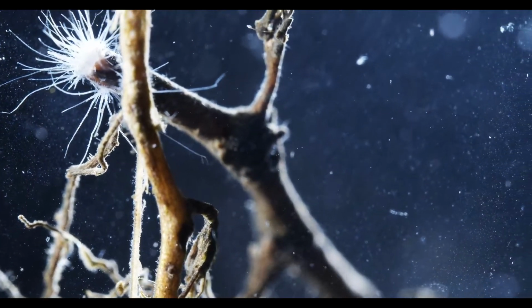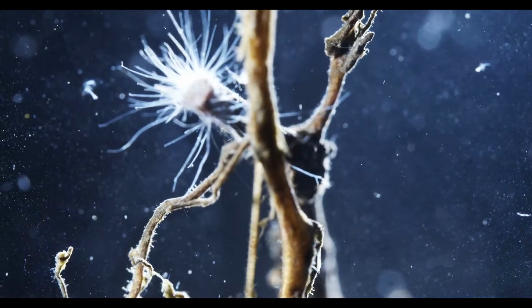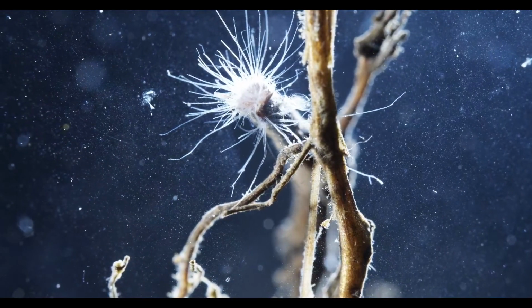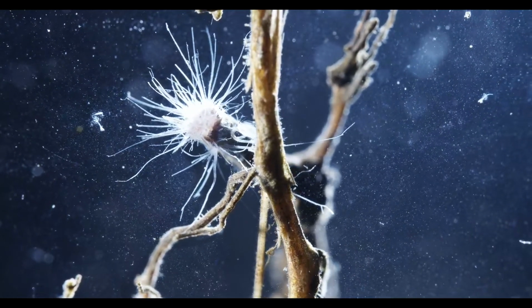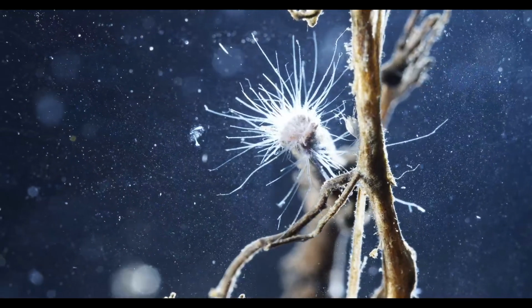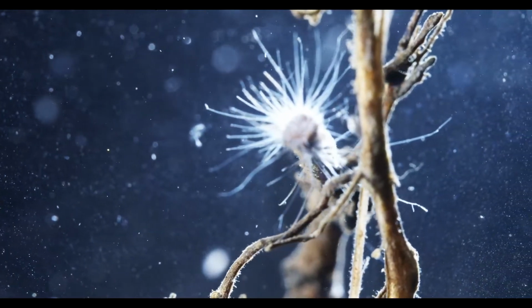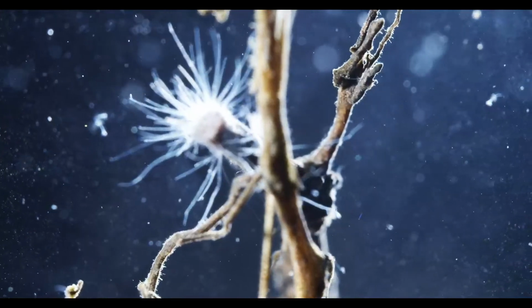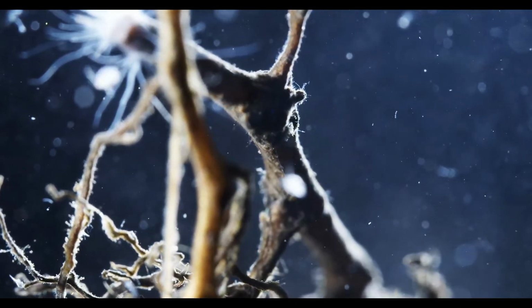Hair algae? Well, it's white. I would assume hair algae has some chlorophyll. Yeah, I was thinking some kind of fungus, or oomycetes, which aren't fungi in a strict sense, but whatever. It ain't a plant, that's for sure.